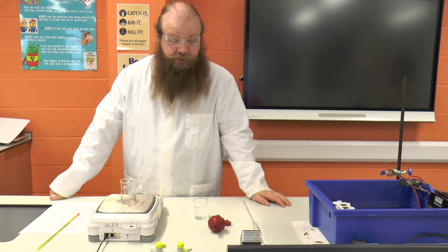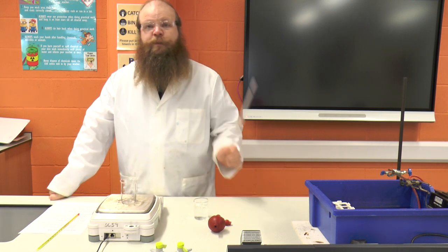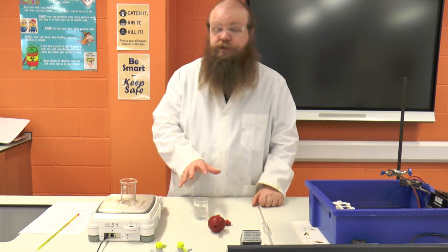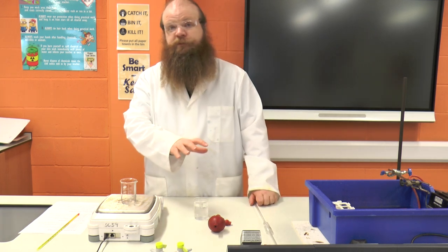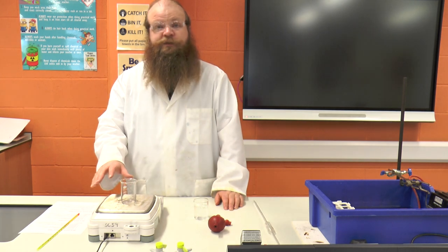Today we're going to be looking at how to check the calibration of a pipette. To do that we're going to need some distilled water, a pipette, a pipette filler, a thermometer, and an accurate two decimal place balance.